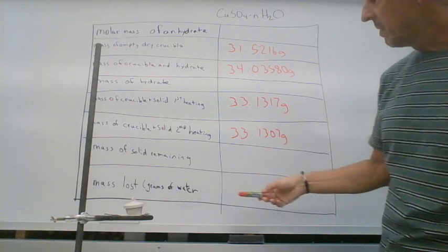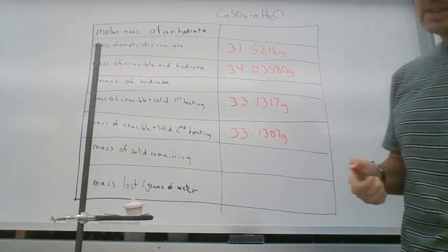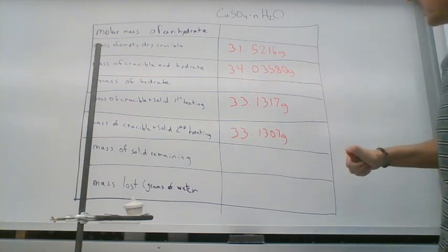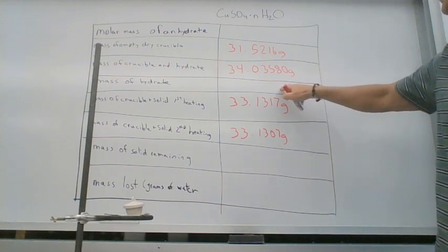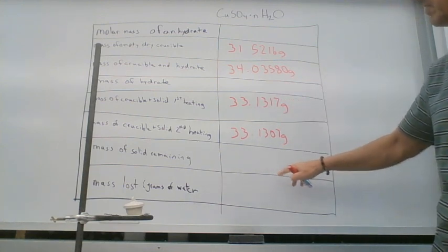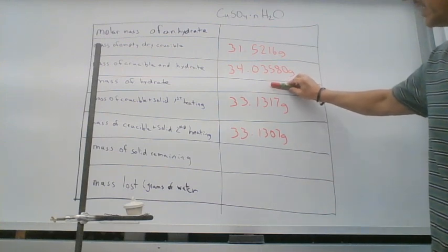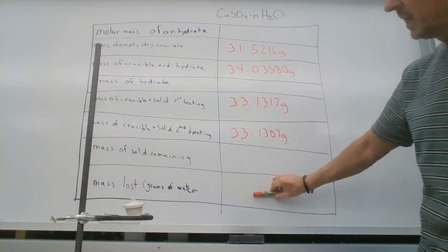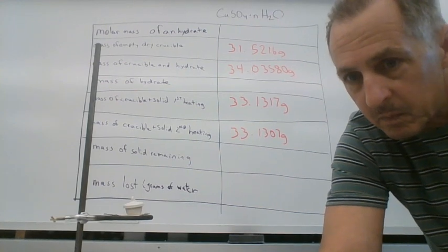Then the mass of lost water would be the mass of the hydrate minus the solid remaining, because what was driven off was the water. So we'd take the mass of the hydrate, the mass of the solid remaining. The difference between those is how much water was driven off in the heating process.